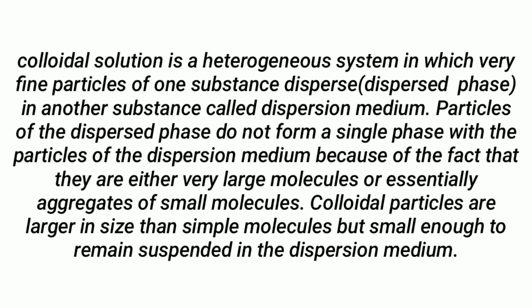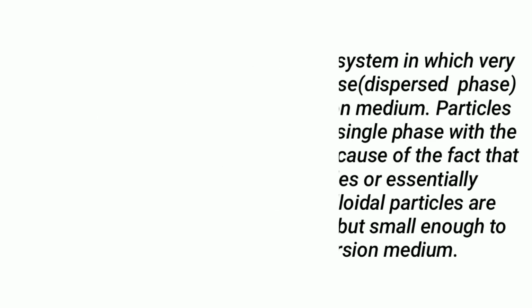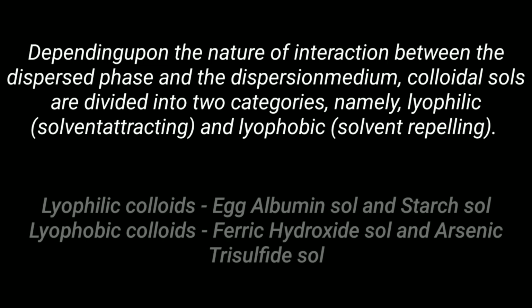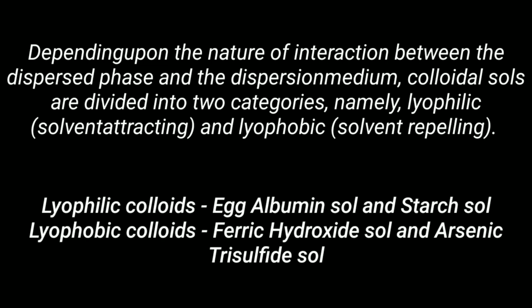Since the particles have larger molecular size, their mixing does not form a homogeneous solution. Colloidal particles are larger in size than those in a homogeneous solution, but small enough to remain suspended in solution. Depending upon the nature of interaction between the dispersed phase and the dispersion medium, colloidal sols are divided into lyophilic and lyophobic colloids. Lyophilic colloids are much more stable than lyophobic colloids because of their increased affinity between the particles. In this video we will be making lyophobic and lyophilic colloids.